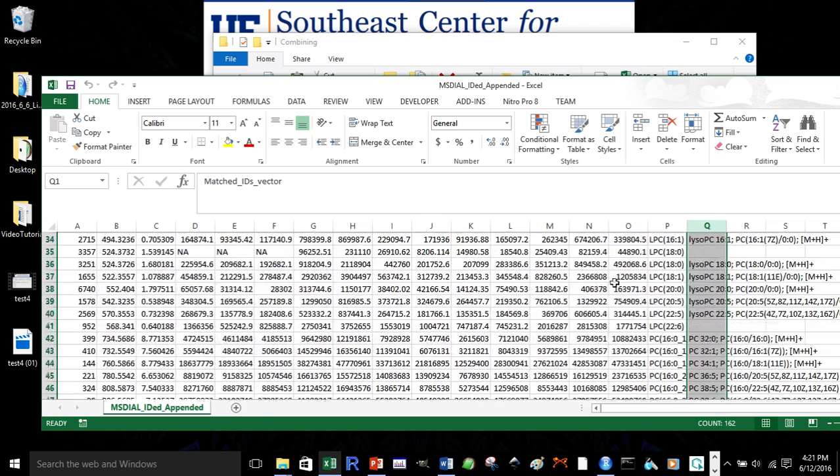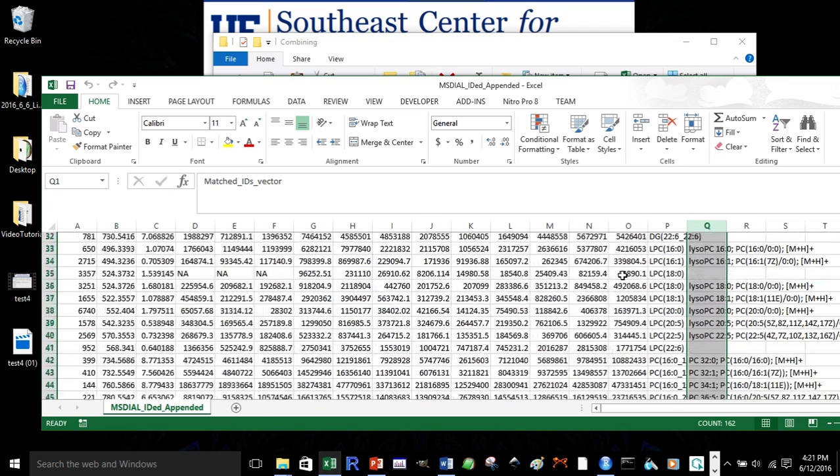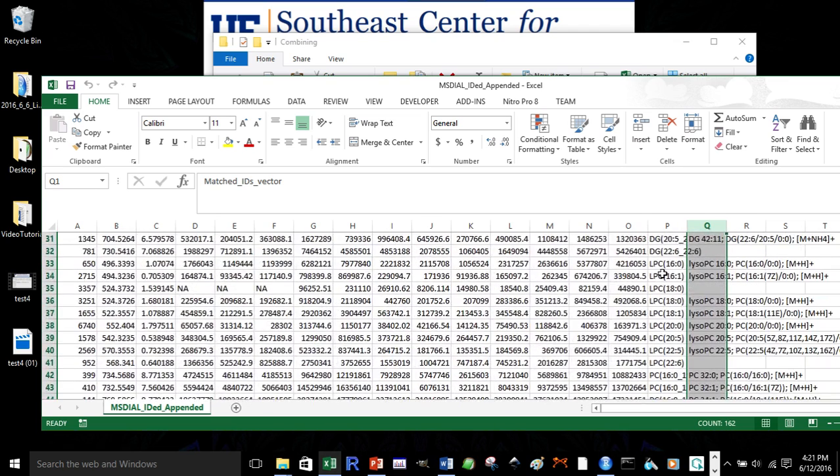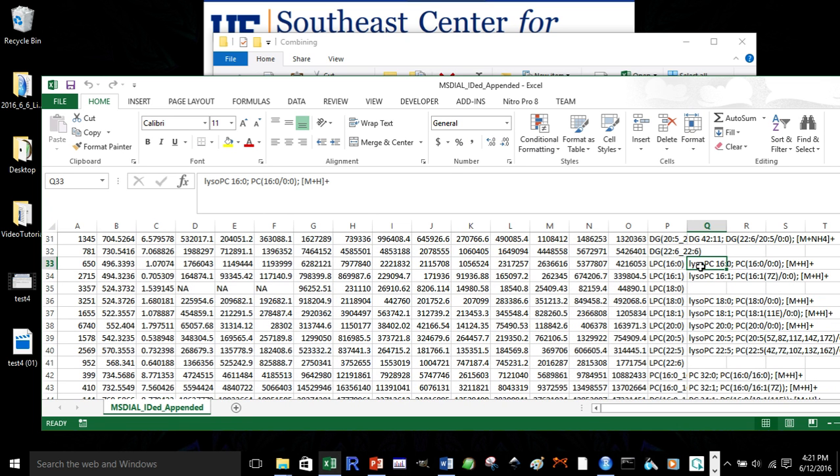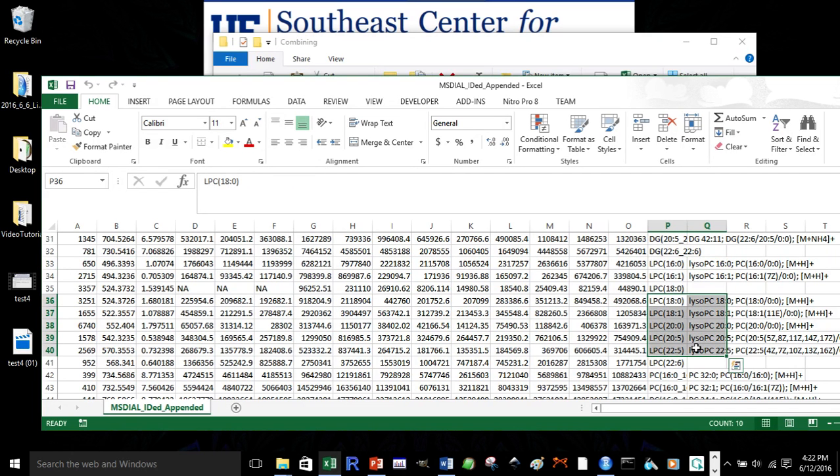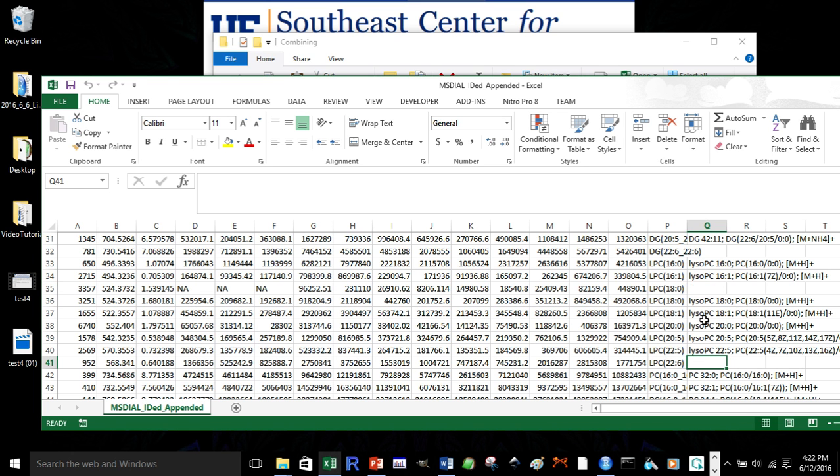So, if we scroll down to LISOPCs, for example, you can see that you have LISOPC-16-0 is also identified as 16-0 using MS dial. So, all of them were identified, in terms of the LPCs, the same in MS dial and lipid match. Although, some were missing from MS dial.